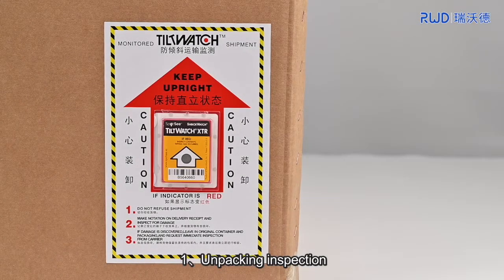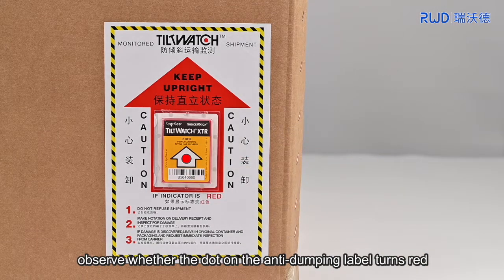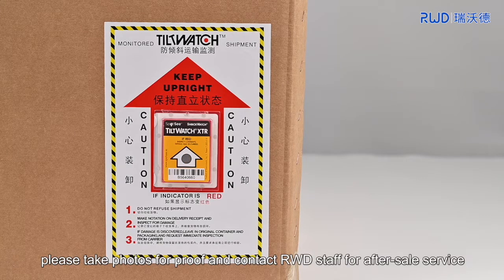1. Unpacking inspection. Before unpacking, observe whether the dot on the anti-dumping label turns red. If so, please take photos for proof and contact RWD staff for after-sales service.